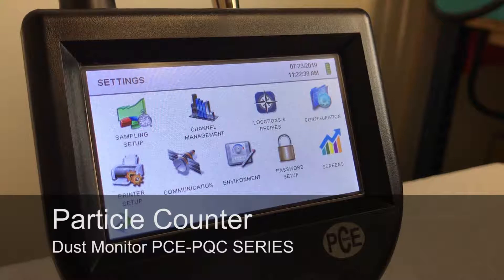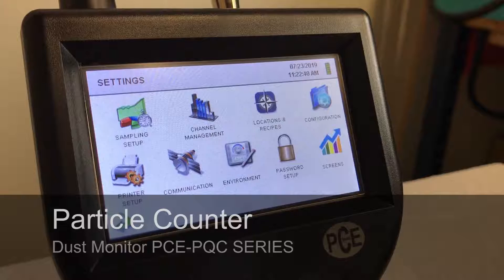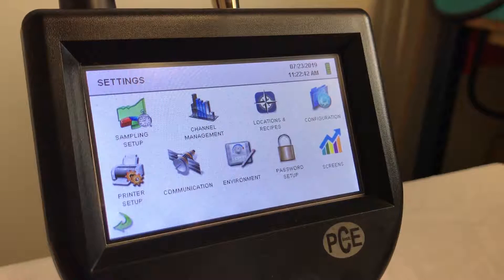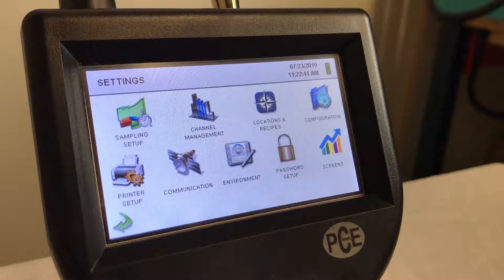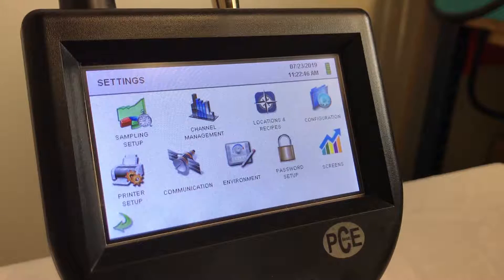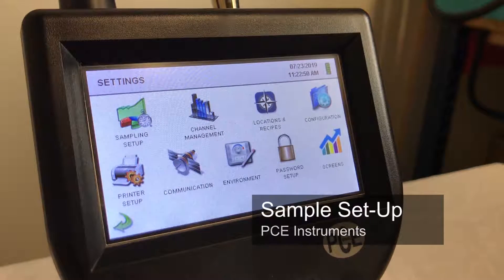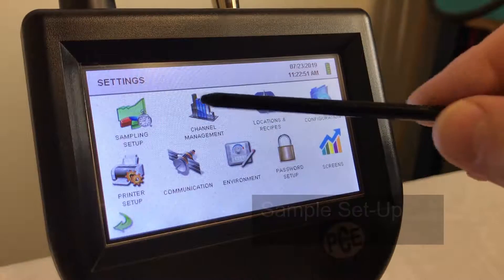We're going to go through the home screen here and just run through some of the different menus and see how you set up the device, and we'll run some samples. So this is the home screen here.